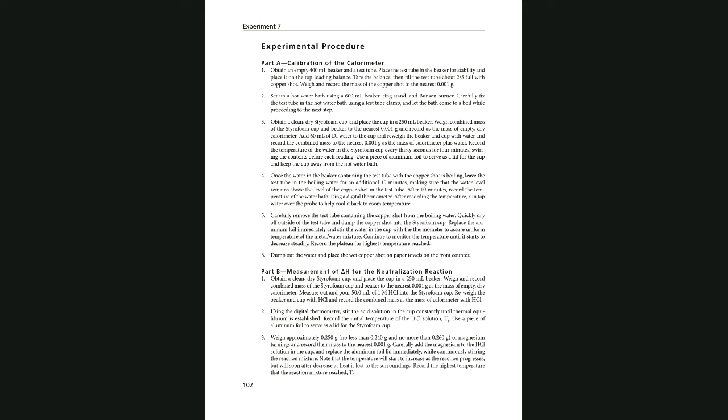Sometimes I skip that part in my class, but now because not everybody is going to skip it, I'm going to do the experiment, so it's going to be a longer experiment. I will just follow the procedure, and I will give you the data for part A. And since I'm giving data, even my students from teaching the class are supposed to do the calculation and turn in that part A of the data sheet as well.